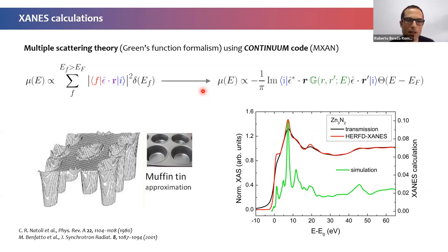In brief, we use the muffin-tin approximation, in which you have your exchange-correlation potential for the different atoms and a constant potential in between the atoms, with an overlap in the exchange-correlation potential. The benefit of doing simulations and comparing them with high resolution spectra is that you can better corroborate your calculations. What does it mean? You have better resolution experimental spectra, so you need better calculations to get a good agreement, right?